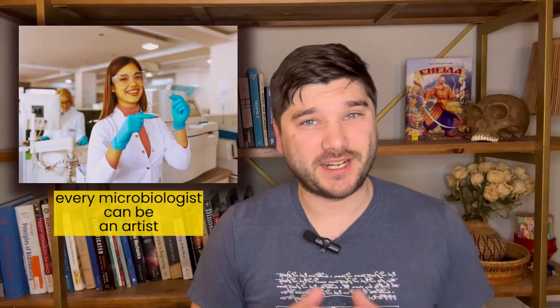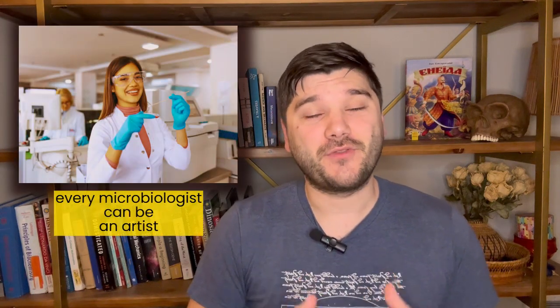But what if I tell you there is a more peculiar method to create art? Actually, it allows every microbiologist to become an artist. As we make significant progress in studying bacteria, we can understand their motion mechanism better and better. Therefore, we can use bacterial needs for nutrients as a source of painting material.